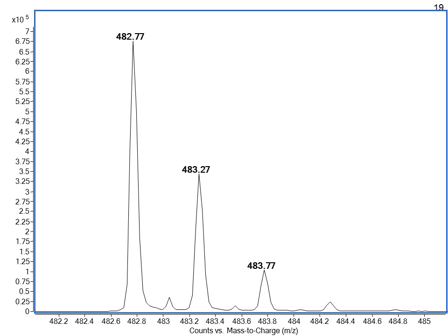Well, let's go back to basics. A mass analyzer does not measure mass, but it measures the mass-to-charge ratio. So this simply means that this ion is doubly charged, because the difference between C13 and C12 is 1, divided by the 2 charges, which gives 0.5. This already shows you clearly that looking at the isotope pattern is an excellent means of determining the charge state of the molecule. On the left side you see the all-C12 monoisotopic mass, and the next peak contains 1 carbon-13.